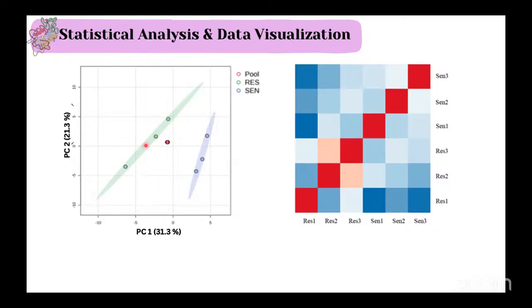Here you can see this is one pool, this is the second pool, and this is the third pool. It performs as an individual cohort. We generally run the PCA for 5 PC values. Generally PC1 and PC2 give most of the satisfying data, which consists of more than 50%. If your PCA plot is not coming out well, you can go for supervised clustering, where you mention this is my control and this is my disease, or group 2. On the basis of these two groups, you identify the best eigenvalues. So your clustered PCA, like PLSDA, can identify and give the best classifiers.